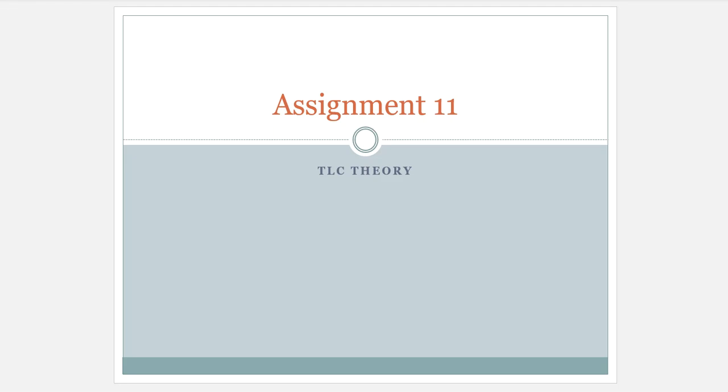All right, in this section of the lecture, we're going to talk about TLC theory, and this starts our next assignment. So what goes on now that my samples have been made and extracted and placed in solvent and sprayed onto the plate with wonderful auto samplers from a company like CAMAG? Okay, what goes on? After this, I need to get the plate to do something. I'm going to have to separate the sample components from each other. Absolutely. So that's what this part of the lecture is going to be concerned with.